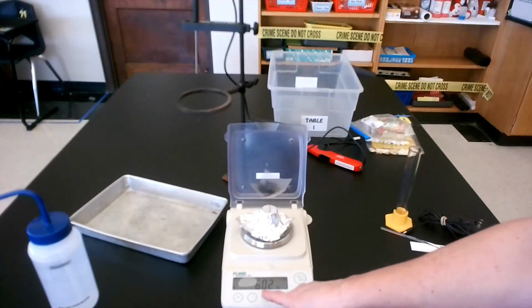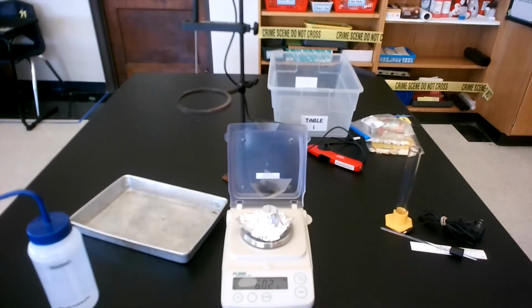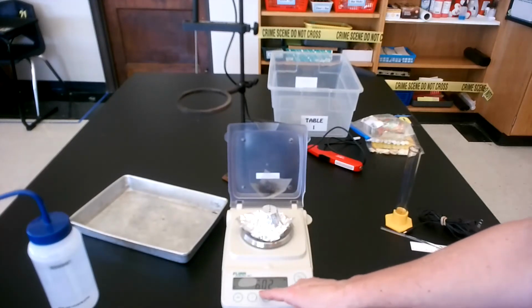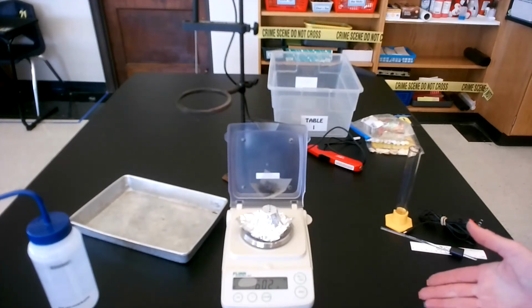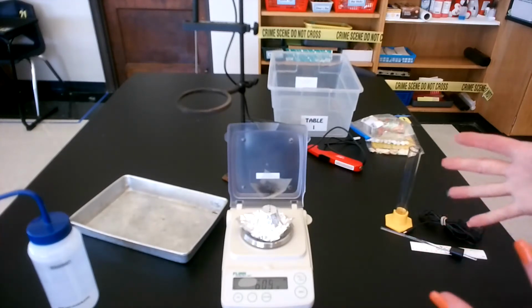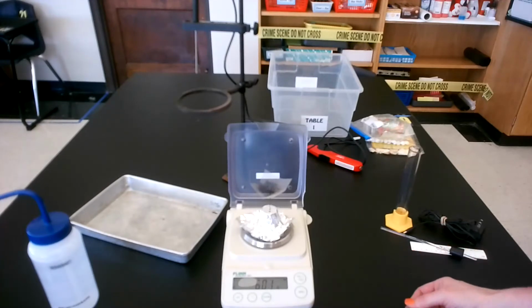Make sure you record all of the numbers. We want it to the nearest hundredth. You are not rounding on these measurements. So I'm going to write down 6.02. Every food holder mass could possibly be different. The screen could be a different size, or the amount of foil that I gave you. So always find the mass of whatever you're testing. Don't assume if one food holder is this mass, the other one's going to be that mass. It could be, but don't assume that.